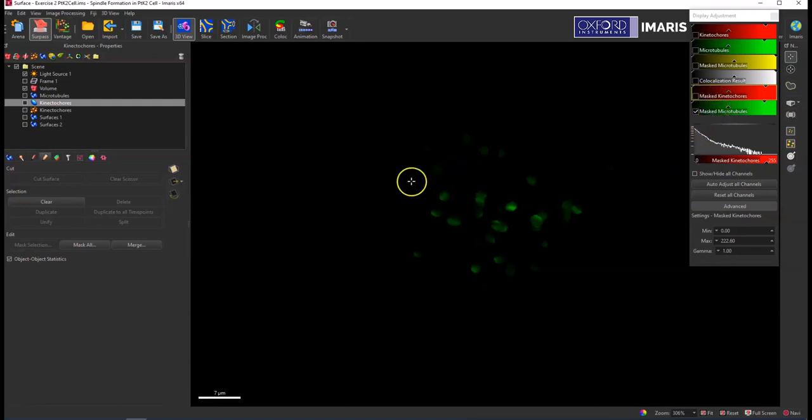So that's just a real brief overview of some things you can do with the object-object statistics and then also the mask channels from those different surface objects. Please feel free to let me know if you have any questions. Thanks!